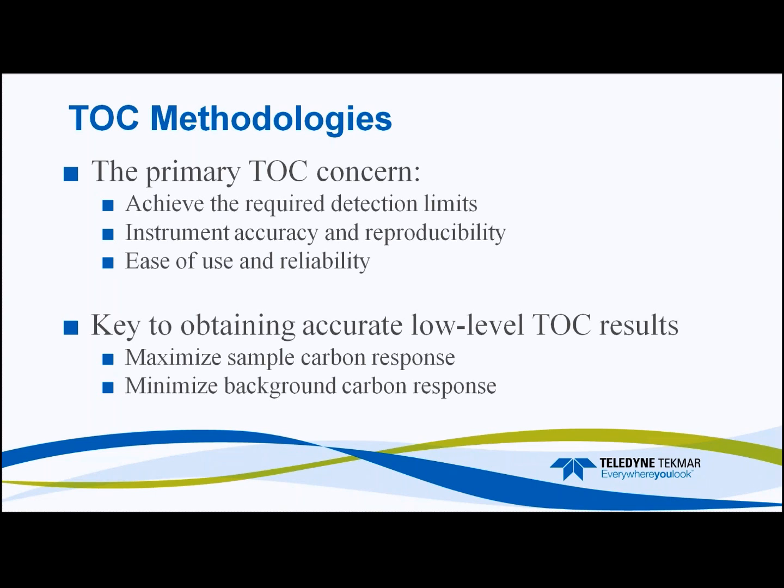And so we need to make it so that everybody can just put the samples on and push start. So one of the keys to obtaining accurate low-level TOC results is we want to maximize any sample carbon response. We want to make sure that our gas is clean, that our DI water is clean, that any air that we have in our laboratories is not causing any background contamination in our samples.